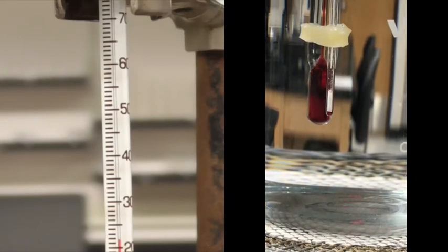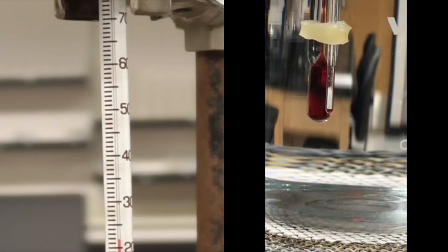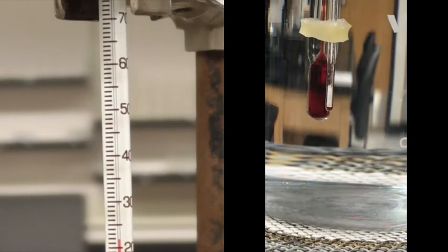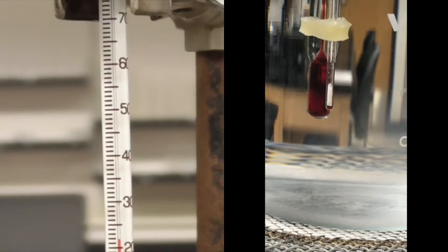And since this is trial one, we're going to do it pretty quickly. Just trying to figure out about where it melts. There we go, Bunsen burner going.